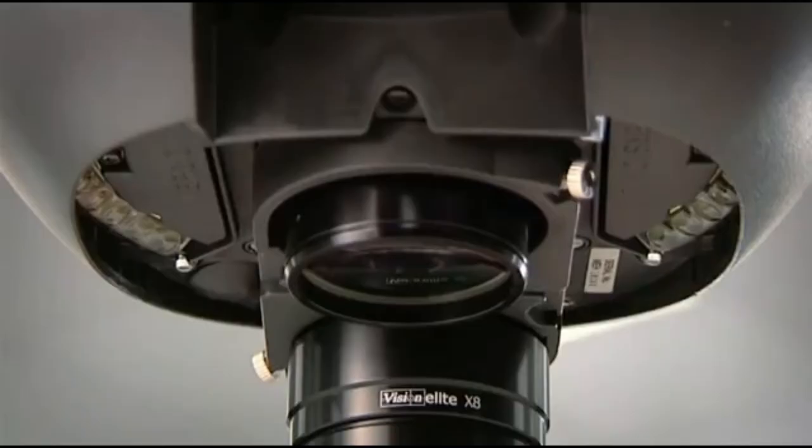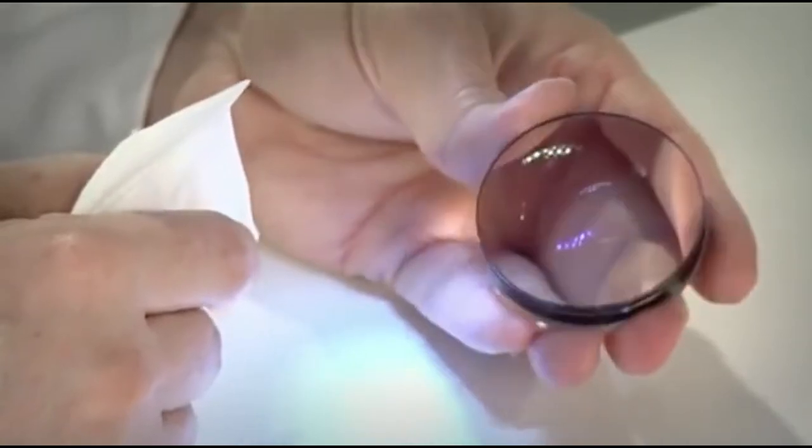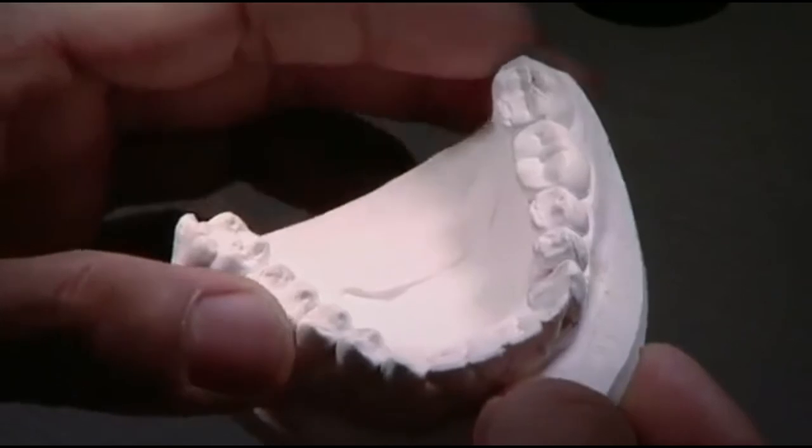Mantis technology is established as the first choice for many inspection and manipulation applications. Different parts of the Mantis family are in use in tens of thousands of sites worldwide, with over 150,000 units sold.